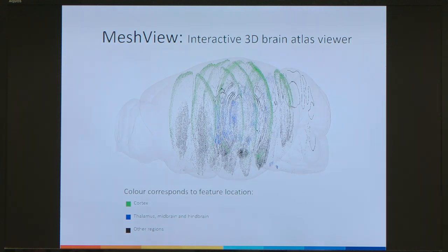This is just a sneak preview of how the objects look in the 3D viewer, which is the mesh view.